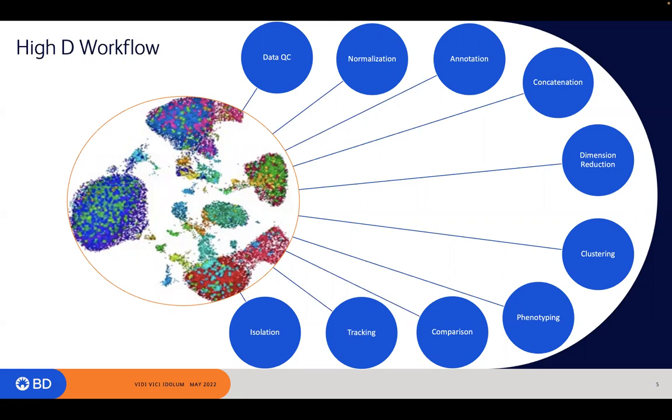But number 2, clustering algorithms have a unique ability to identify cells that I would say the human eye is not necessarily privy to. What I mean by that is a lot of mid-expressing cells, right? Any marker that is sort of mid-expressed, or cells that are moving along some sort of trajectory, clustering algorithms tend to pick those out a lot better than the human eye does when it comes to manual gating. So I like clustering algorithms for giving you this fresh perspective on the data, to find those mid-expressors. Ultimately, we'll have to figure out whether or not those mid-expressors are significantly different than the ones that are high or low, but the point is the algorithm sees them and pulls them out for you.